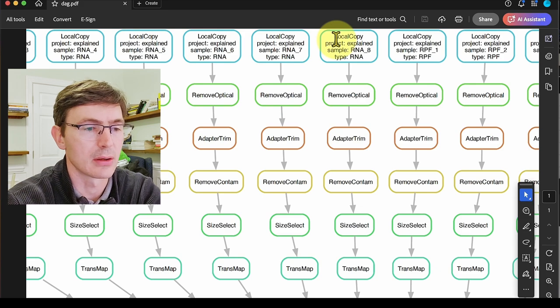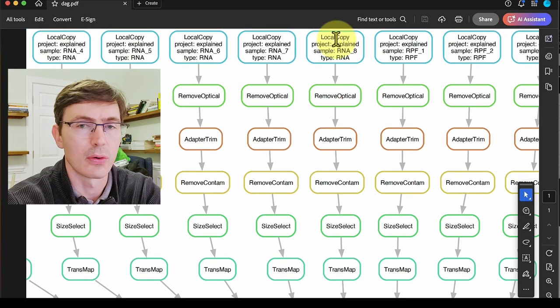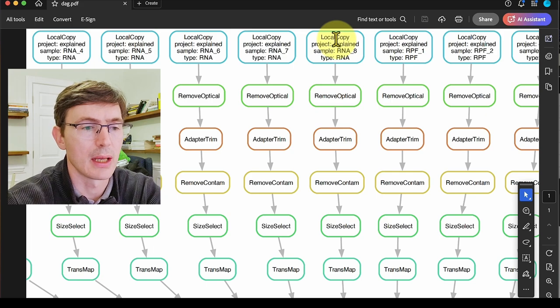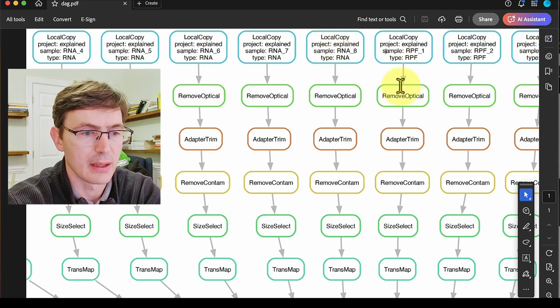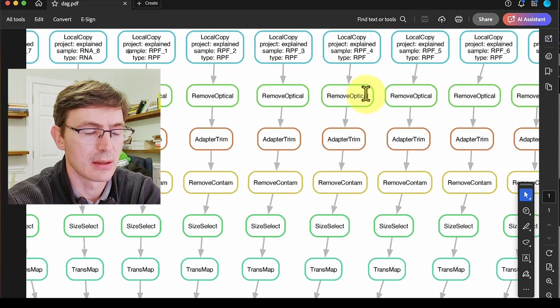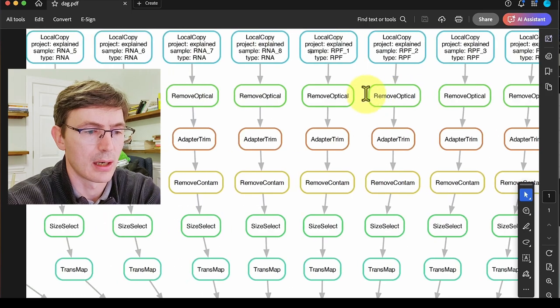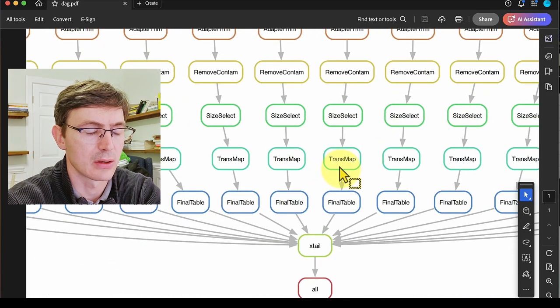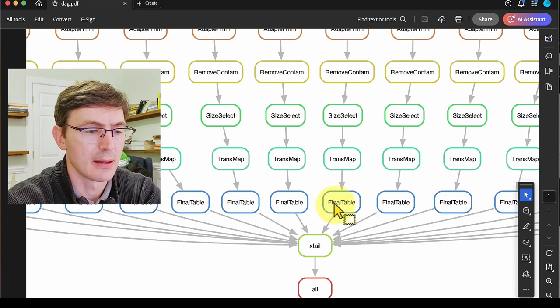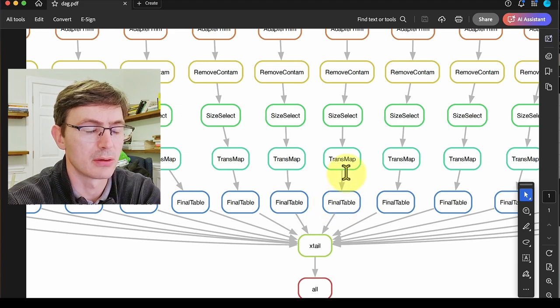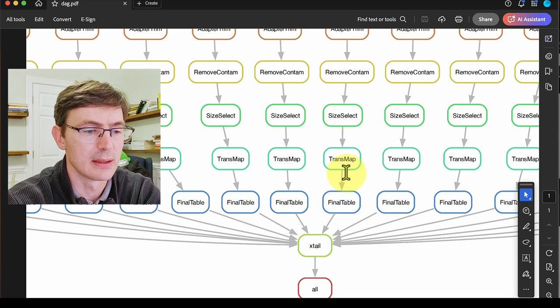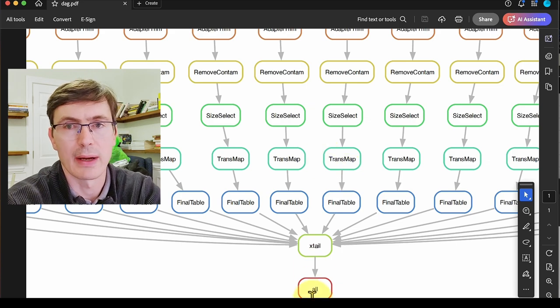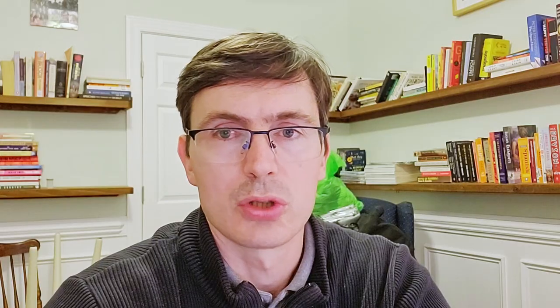If we look, we start here at the top with this local copy rule that copies the FASTQ files, and this is done for each and every single FASTQ, both for the RNA and the RPF conditions. You see that these rules are quite linear for each of the independent FASTQ files. But at the end we create these tables that are coming from mapping those processed FASTQ files, and we feed them into this function xtail that will give us the final file that we want.